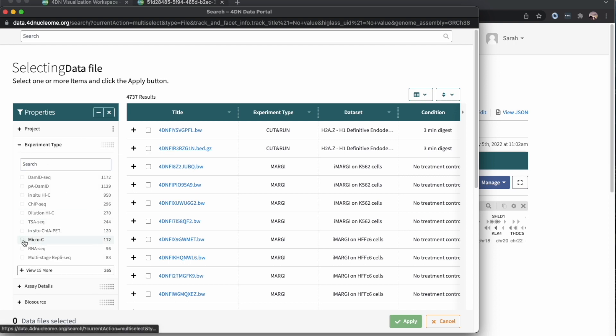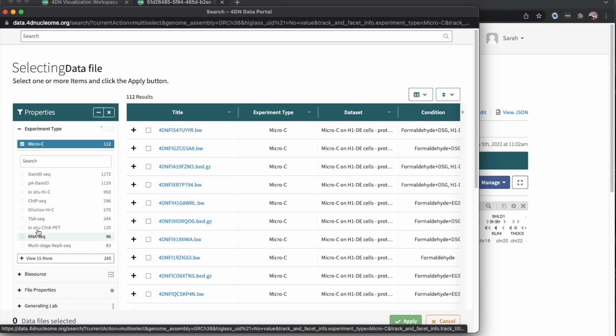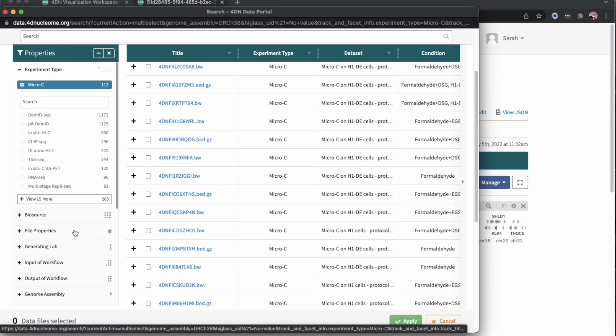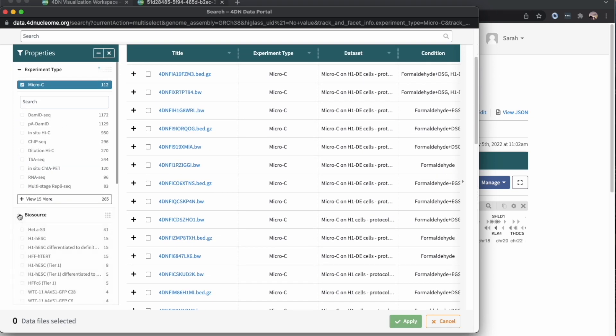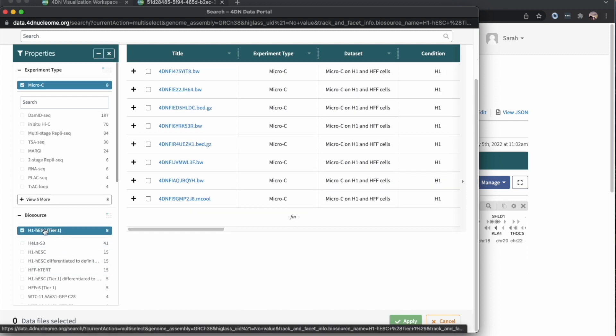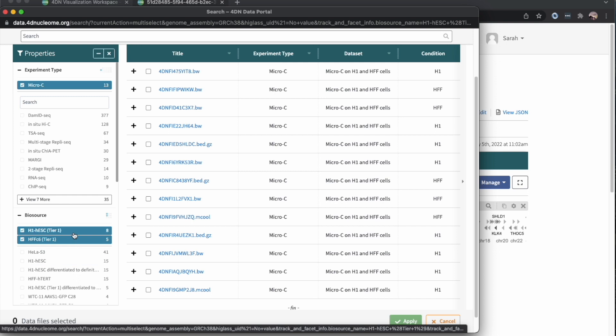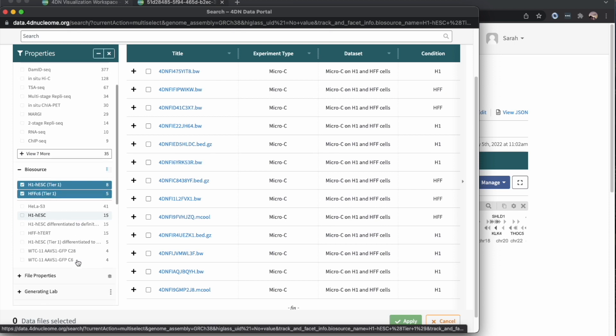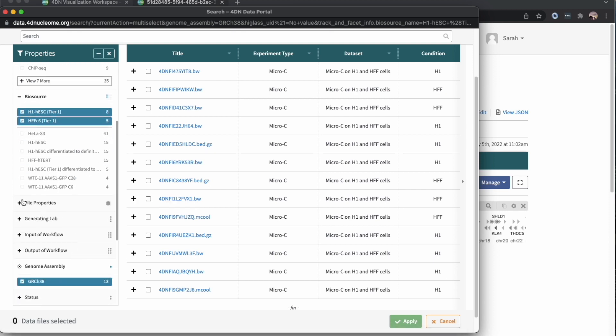To start with, I'll look for micro-C experiments, so we have some high-resolution contact maps. In biosources, I'll click on the Tier 1, H1, and HFF cells. The Tier 1 cell lines are the lines used by 4DN labs from controlled batches that have higher reproducibility.